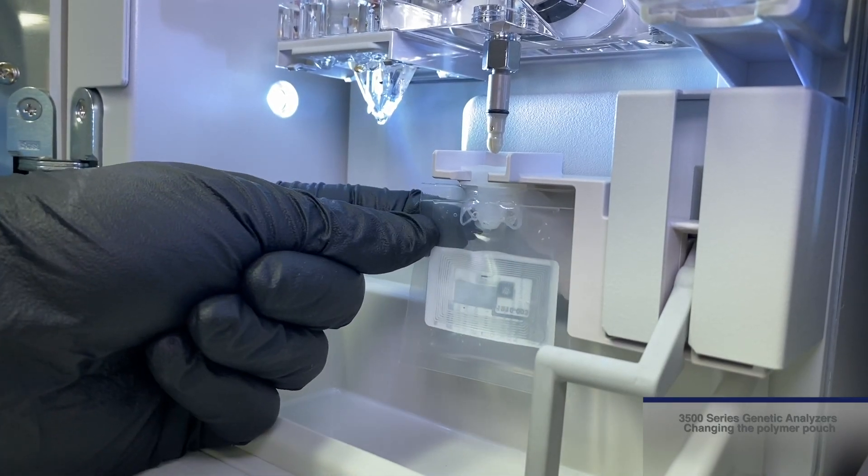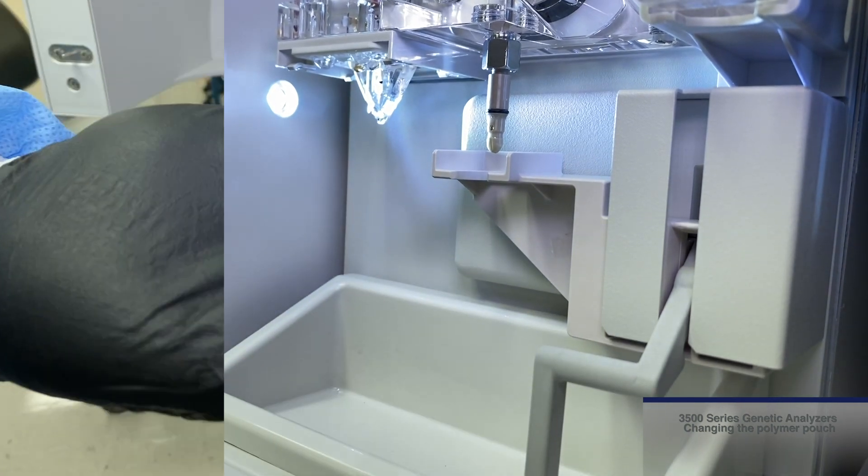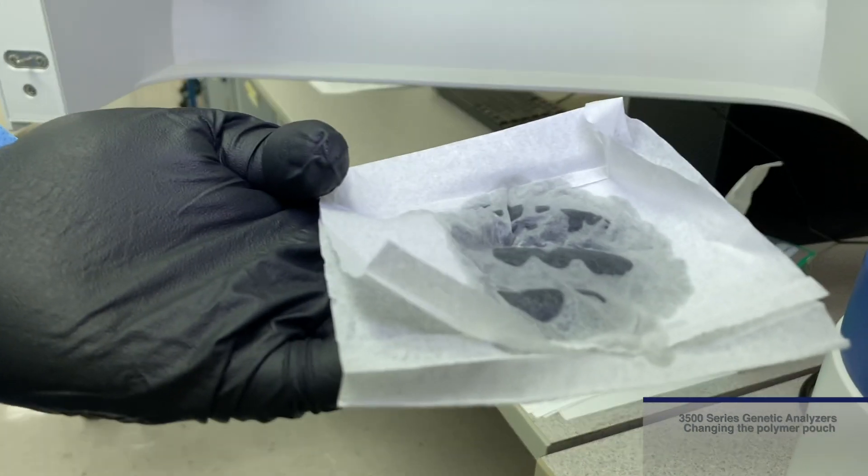Once the lever is down, remove the old pouch and clean the connection with a lab wipe moistened with purified water, then dry.